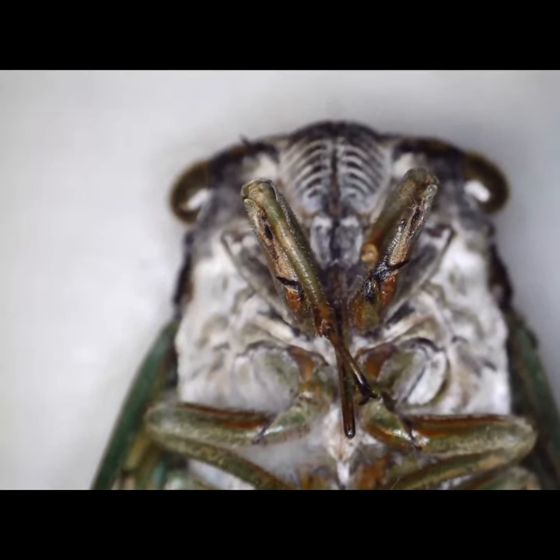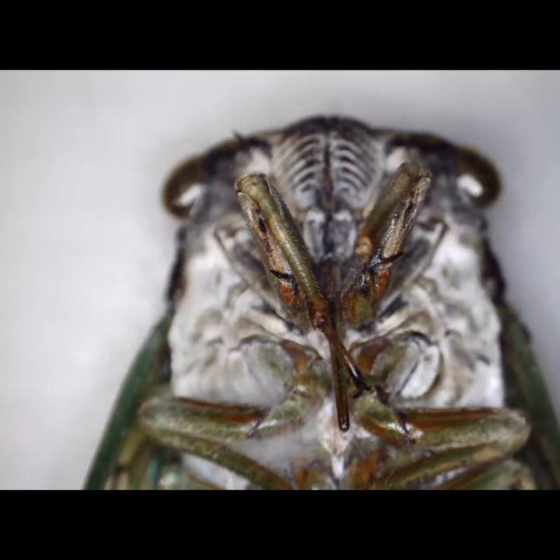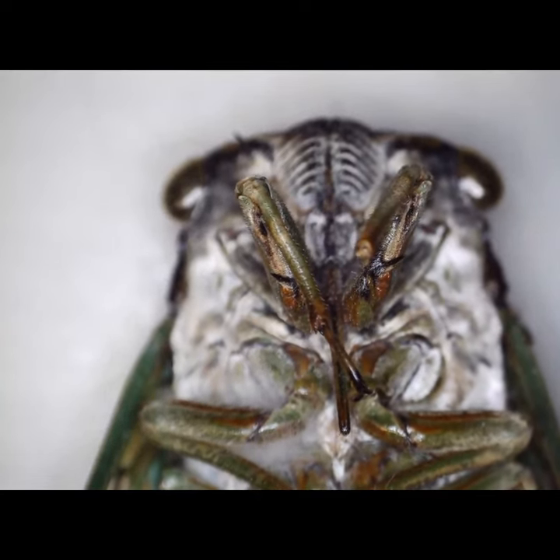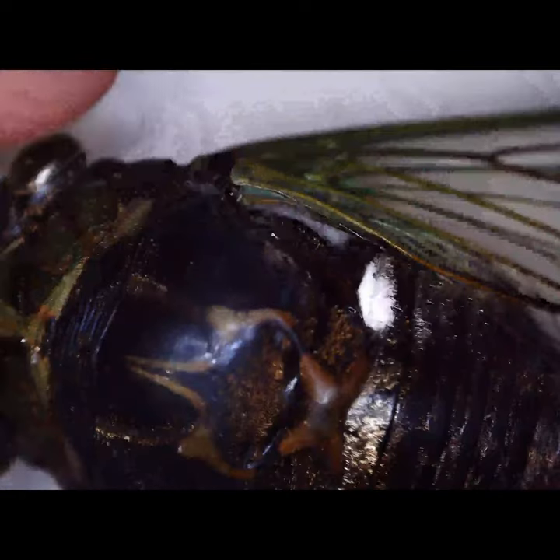What's up YouTube, this is part two of my cicada video. The last one I had one of the shells, or pupa, that it molted from, and this is what they look like after they molt — this is an adult. They live a couple weeks.